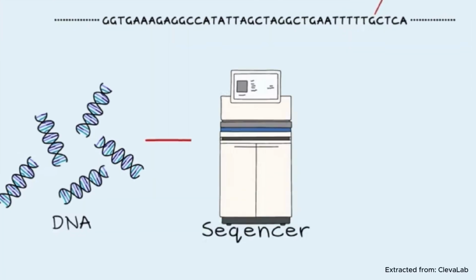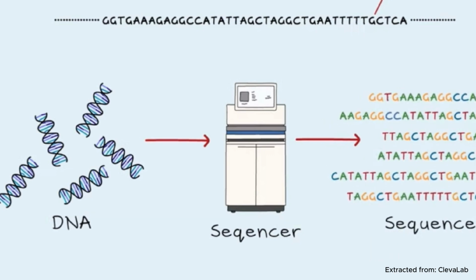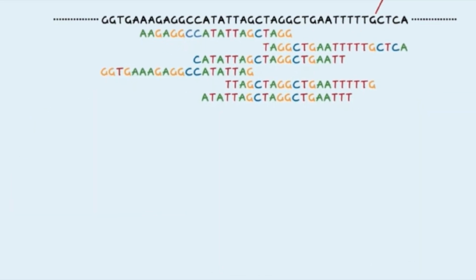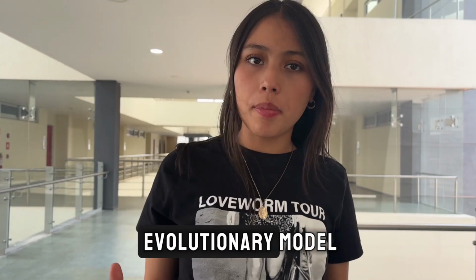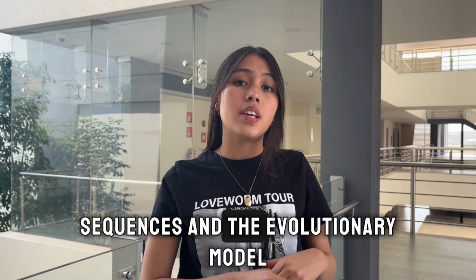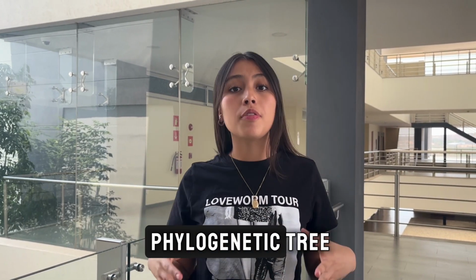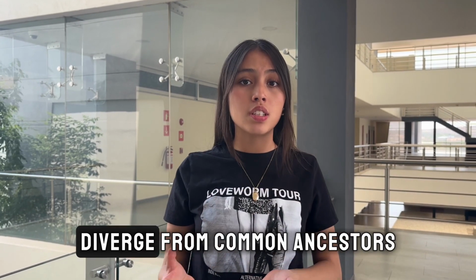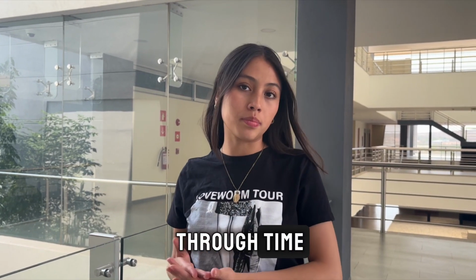Next, we perform a multiple sequence alignment using MAFFT. This aligns similar regions across all sequences. We then apply an evolutionary model to estimate how the sequences have changed over time through mutations. Based on the aligned sequences and the evolutionary model, then we construct a phylogenetic tree. This is for visualizing how the insect species diverge from common ancestors through time.